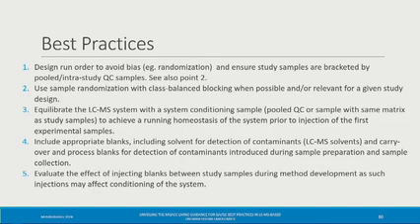What would you do? Yeah, so I think the idea with system suitability is it should be the exact system you're going to use for your study. So it should be the exact column you're using for your study. And if you're alternating between 4 columns, then I would do an injection on each of the 4 columns that you are alternating throughout the study. So I don't think you can use a different column for this. I don't think it's a good practice. Okay, great. Thank you.